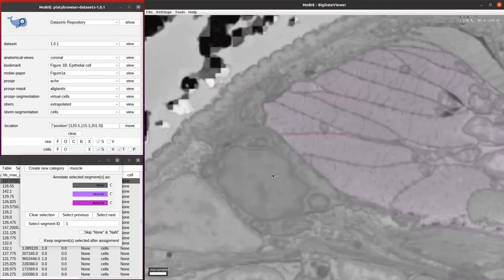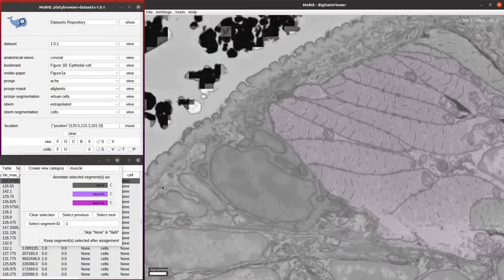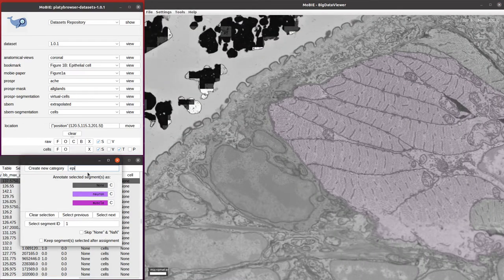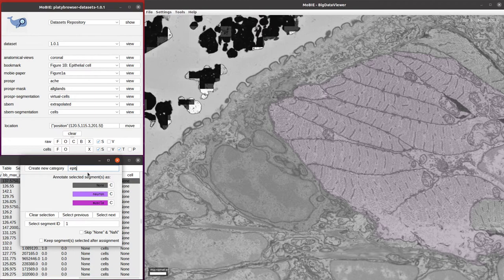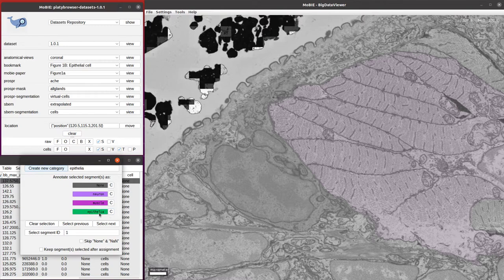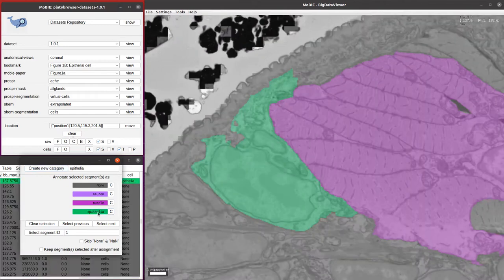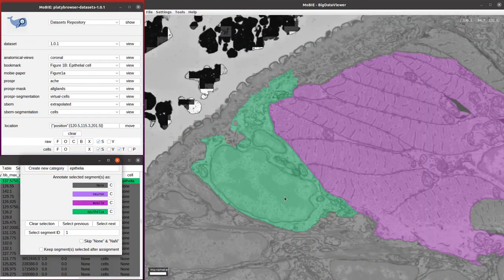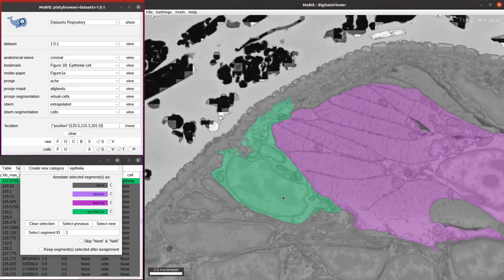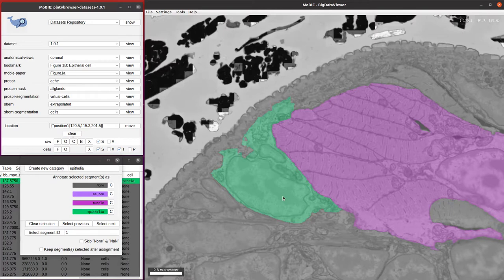Once we're satisfied it's an epithelial cell, we can then type over here a new category, epithelia, and then click to create that new category and then click that button. We see it turns the right color and gets assigned as epithelial cells.